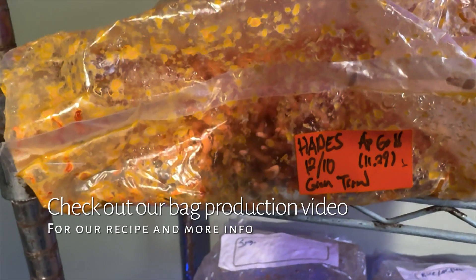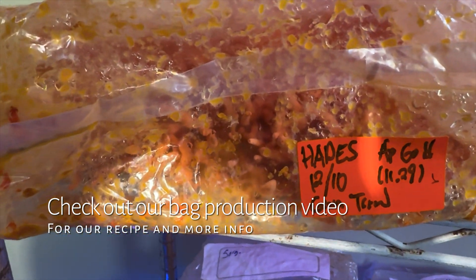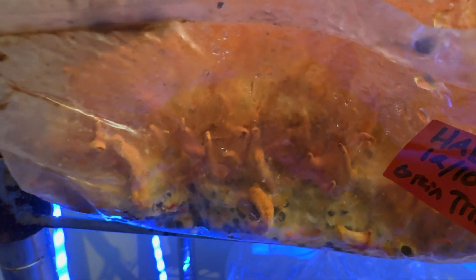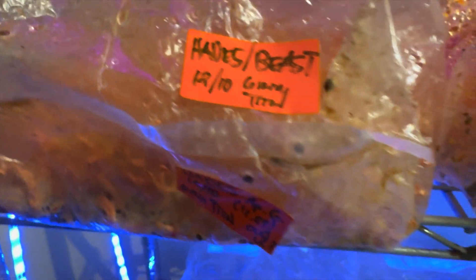It's hard to get a picture in there, but the rice and millet combo is doing well. Then straight sorghum — it's not as good as the rice and millet, but there are still decent formations. These are all inoculated at the same time, December 5th, and they're all the Hades strain.